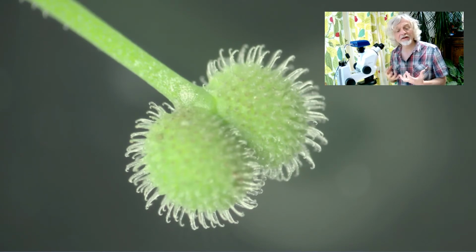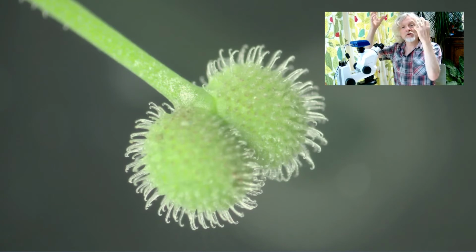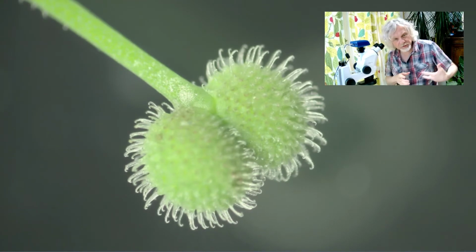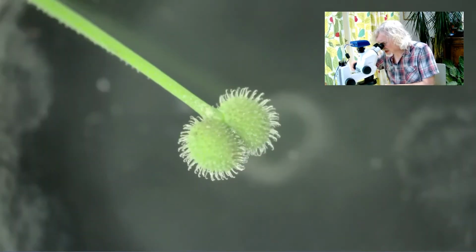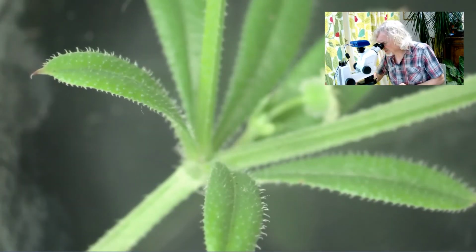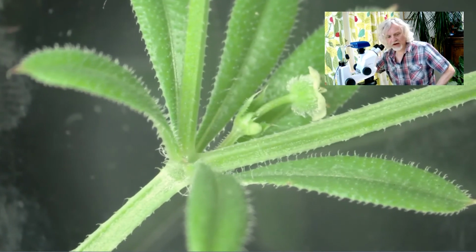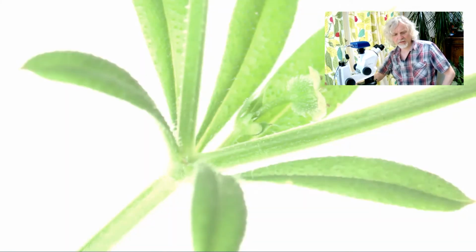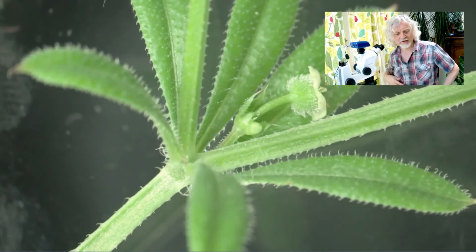And clearly the point of the hooks is to help this thing hang on to anything that it grows up next to so that it climbs up and up and up. Hence, Robin run the hedge, because it runs through the whole hedge. Now, some of the names of this thing are quite interesting. That's a lovely bit. You can see all the lovely floret of leaves there. Let me put a white background behind it. No, too much light. Black background's much better.